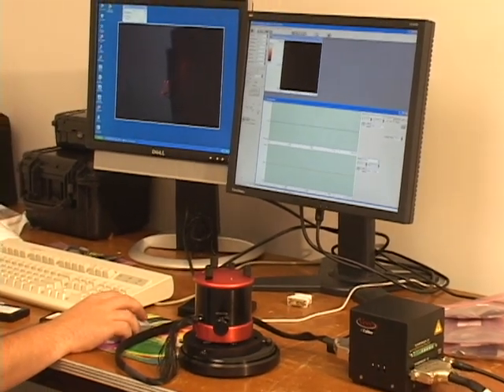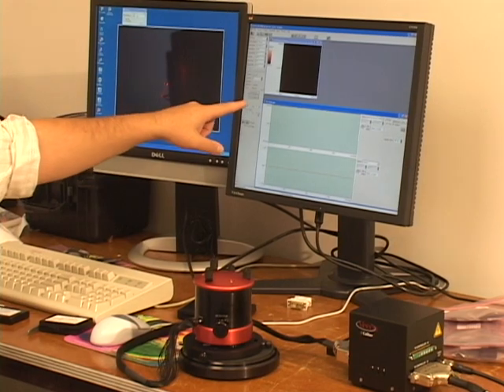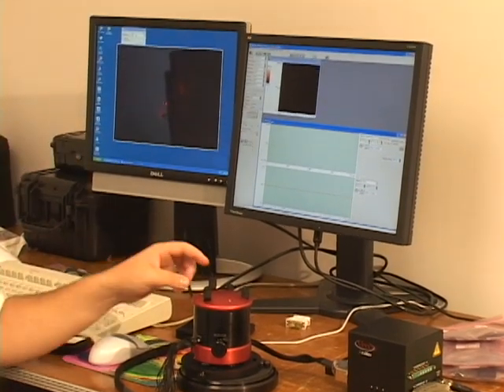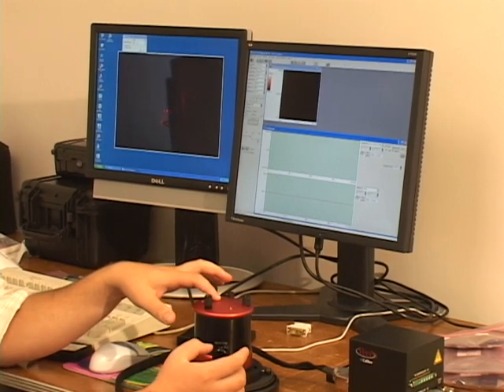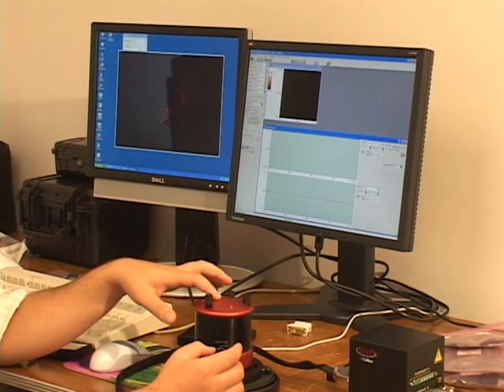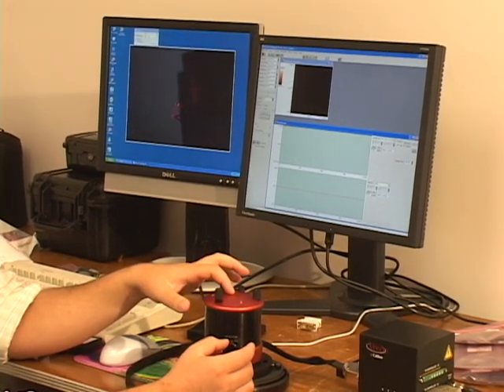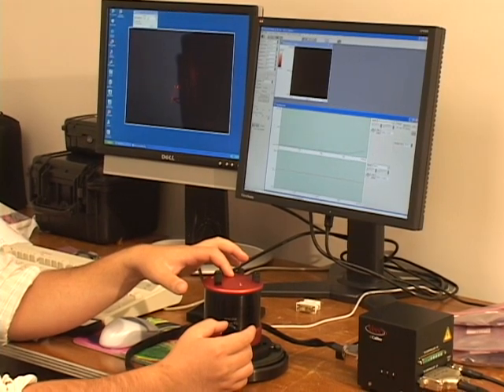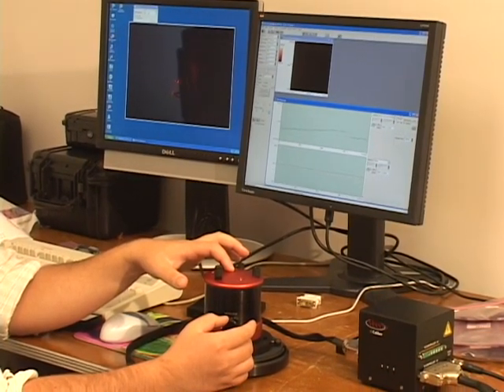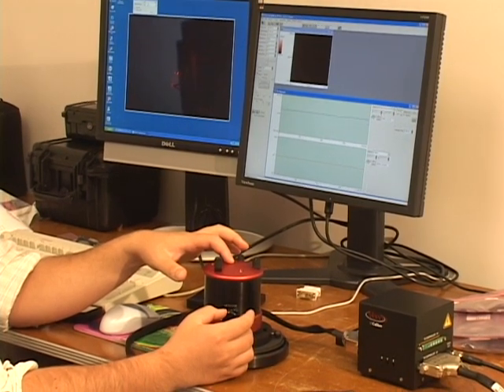Afterwards, go to the top bottom signal, click on that, and you'll see it's capped off at the top. Same thing, only using a different knob. Use the top bottom knob, and since it's at the top, go counterclockwise to bring it back down. And this one's very sensitive, so I brought it way back down too fast. So I gotta go back up top. And just like the left right one, make sure it can go through 0, which it did.